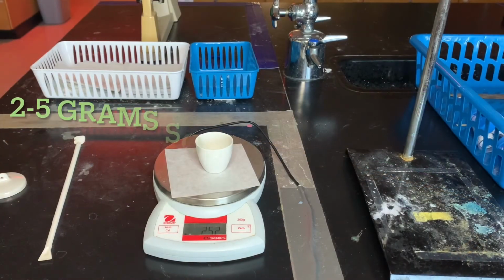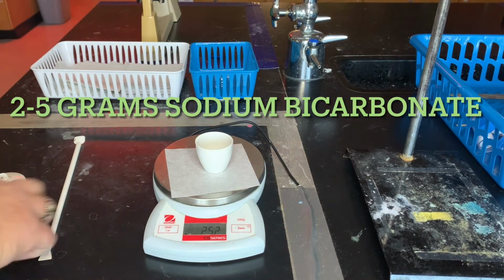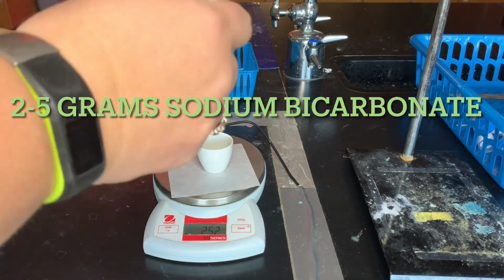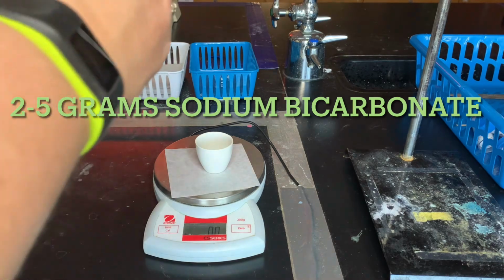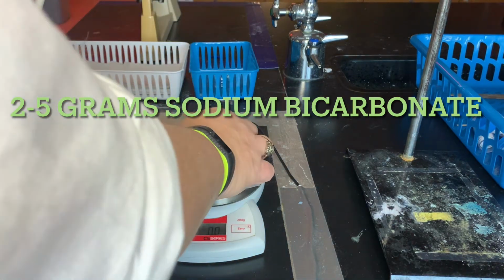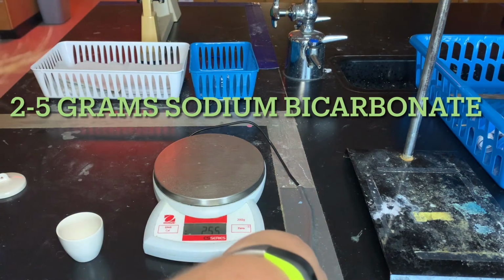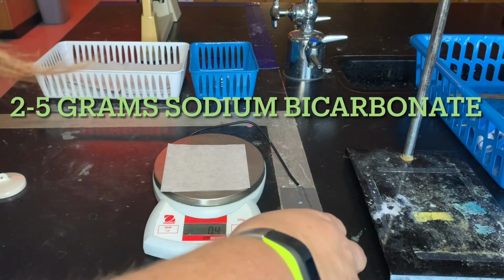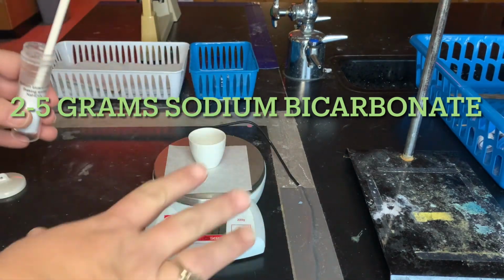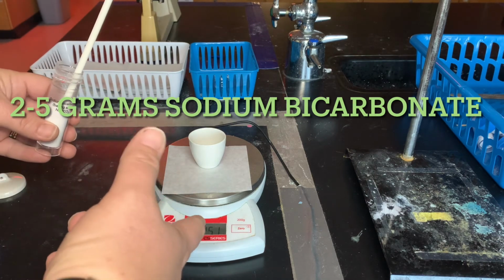So we're going to weigh out our sodium bicarbonate. And I'm going to zero it out now. If you want to, you could get a total mass of the crucible and the amount you're putting in there.